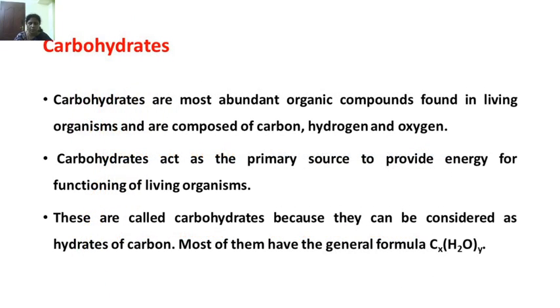Today we are going to discuss the test for carbohydrates. Among this, first we have to discuss about the Molisch test. In this module, we are going to discuss the principle, procedure and the results of Molisch test. This test is very important for the analysis of carbohydrates.